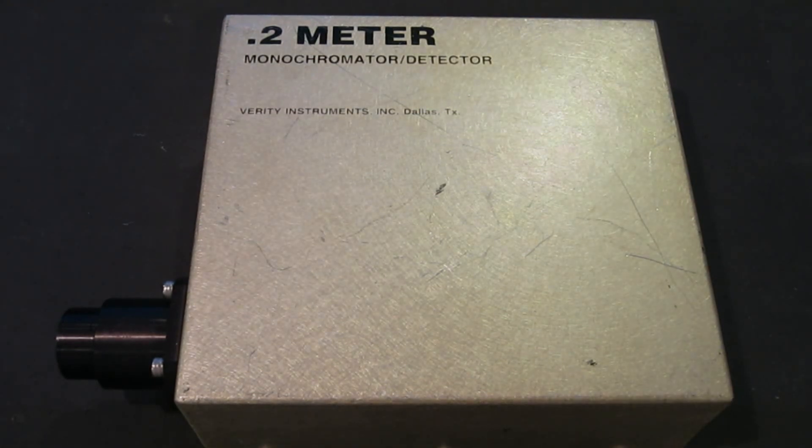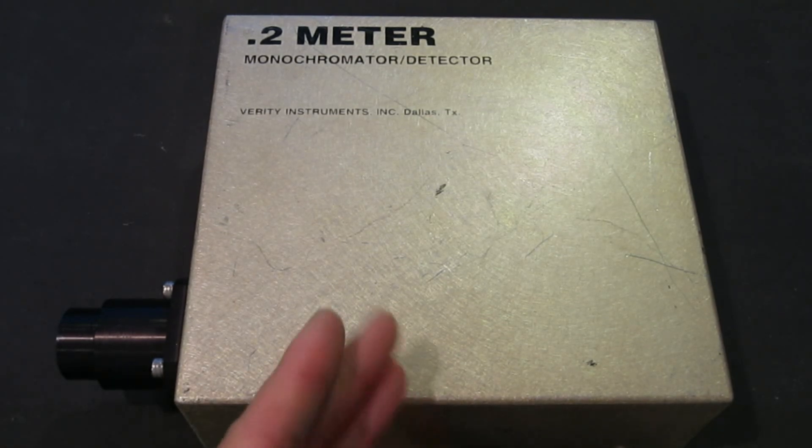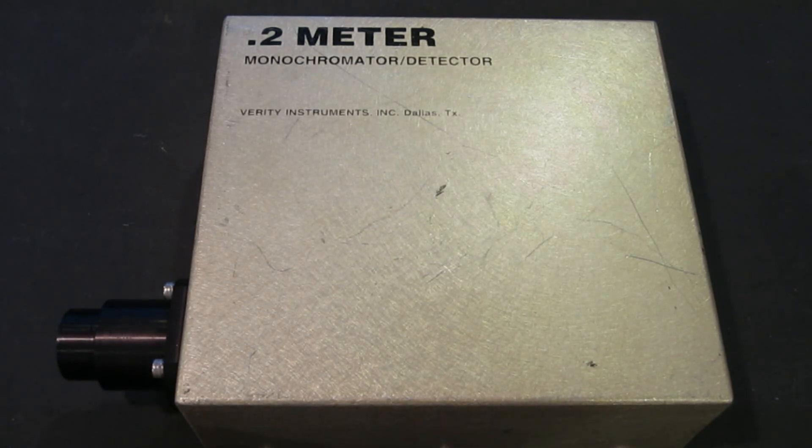If you want to learn how a monochromator works, there are a lot of resources you can find on the internet. But at a very high level, this monochromator uses a diffraction grating where the light goes in and can be diffracted into different angles based on their wavelength. By adjusting the mirror's alignment, you can get your desired wavelength coming out from the exit slit.